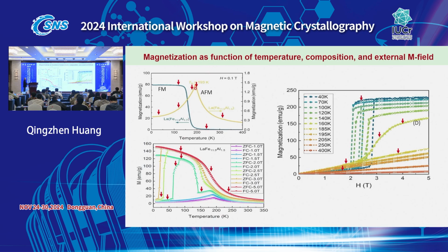This is not limited, okay? For example, in this one the ferromagnetic signal builds up very, very slowly. Starting from 400, it starts to change, and then eventually goes down here. And it's also all very slow. So if we want to see what the behavior is like, then you also need to collect some more temperature points.